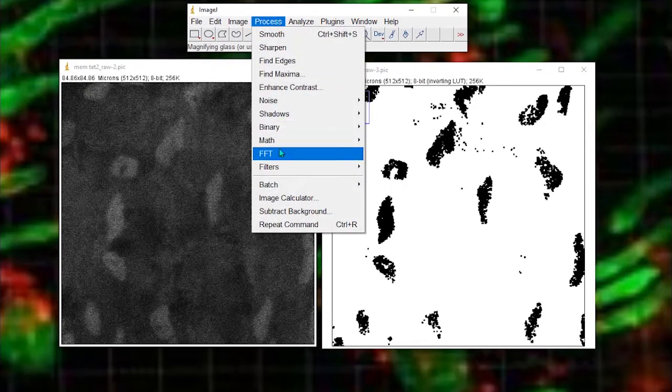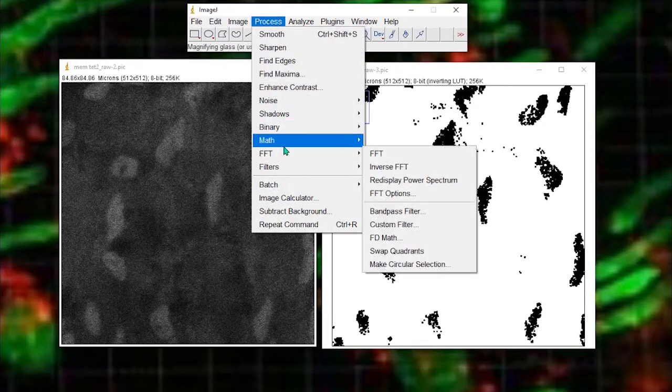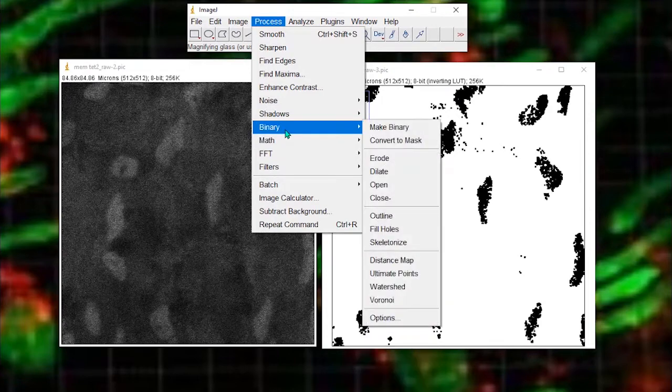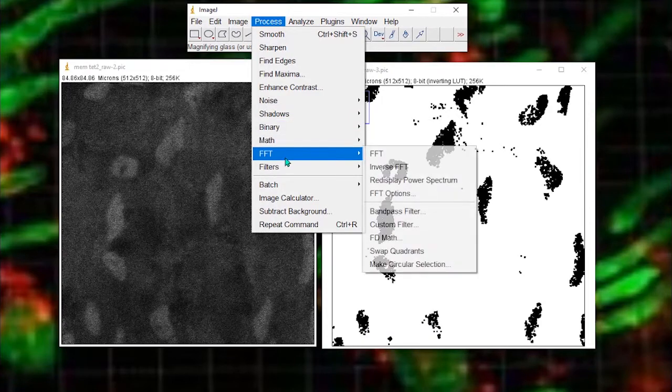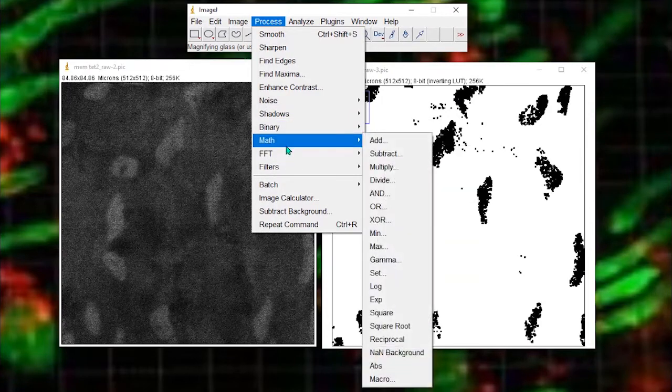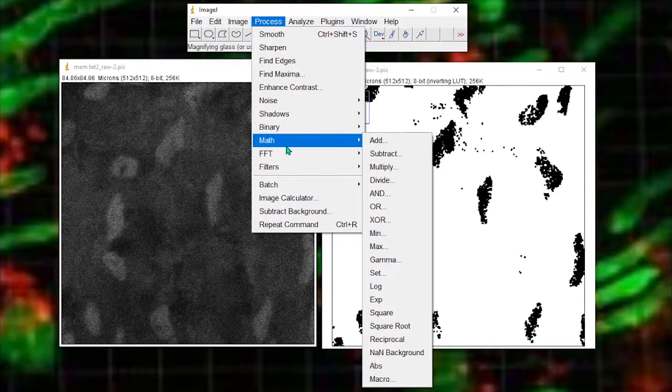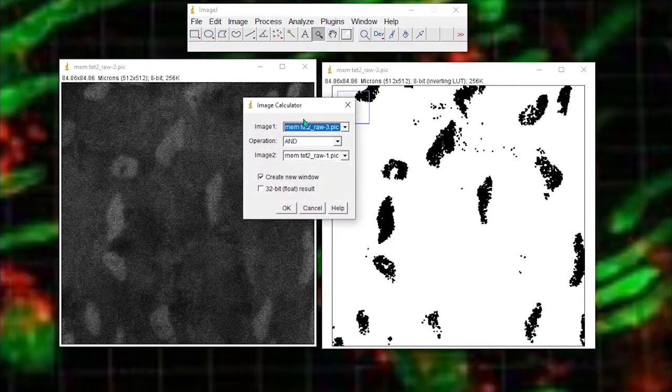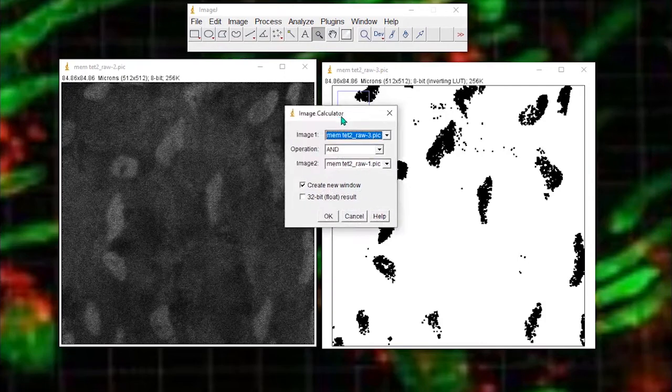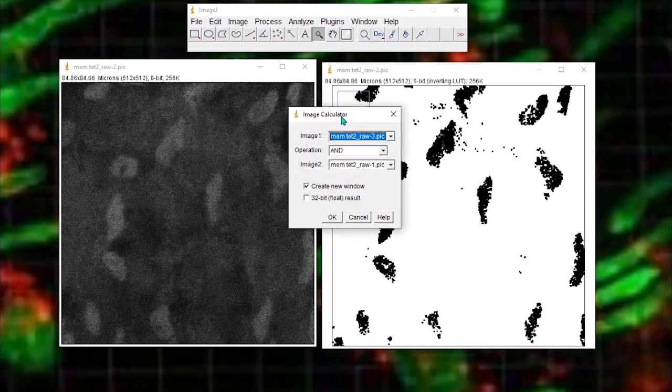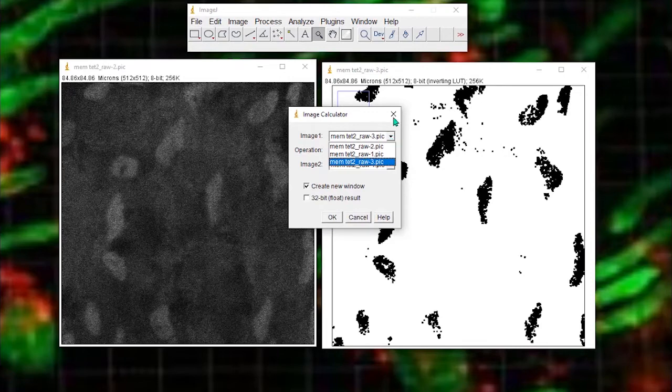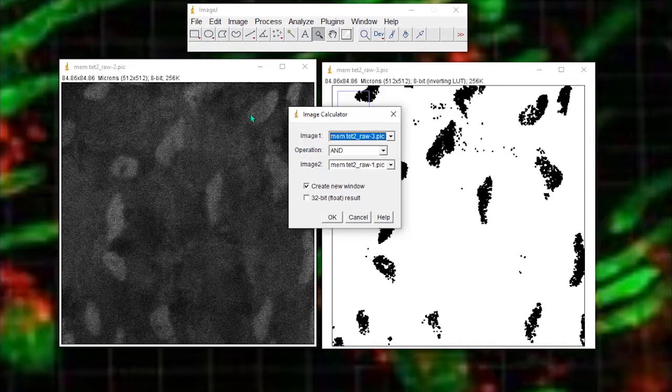I'll go process, binary, where's it? Math. Oh, where did I put it? Oh sorry, image calculator. Still early morning here. So my image one will be my mask, that's raw3.pic. And my original image is raw2.